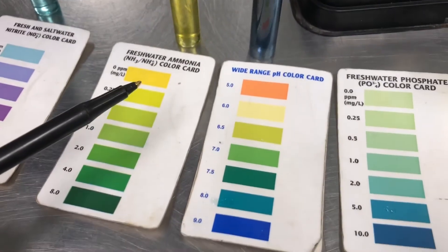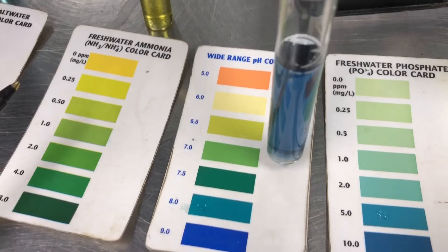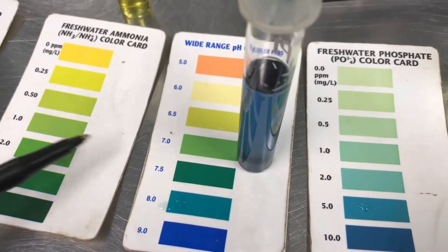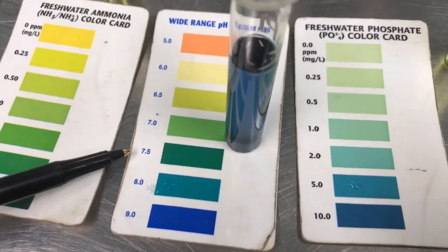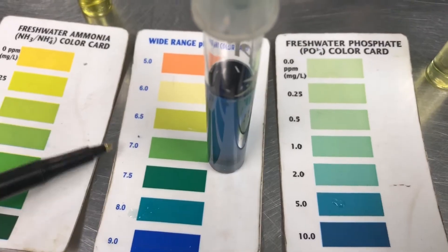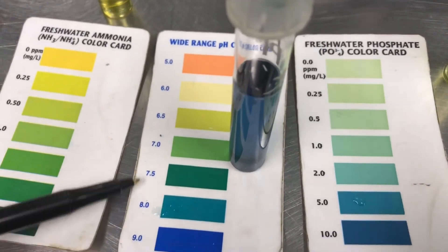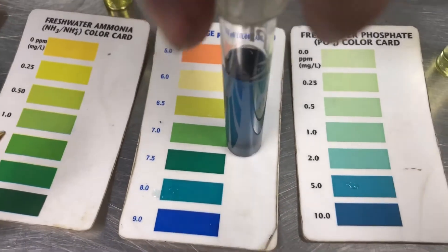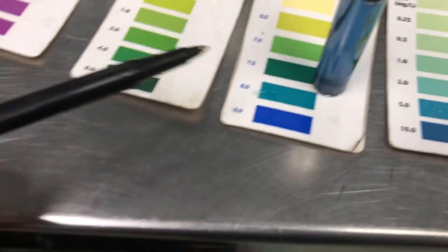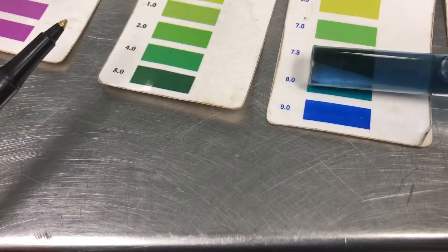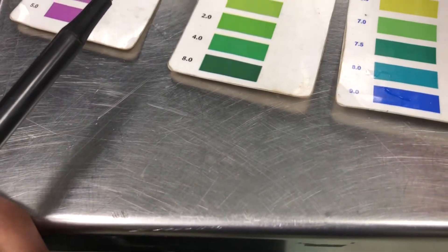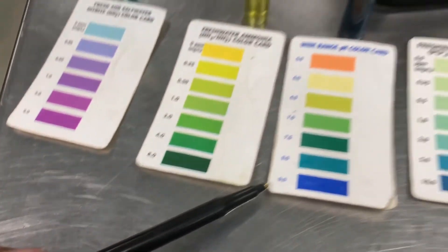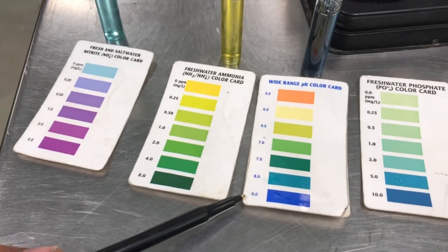pH. Now pH is a little different. You want pH at 7.5 is perfect. You know, I'd say anywhere from seven to eight is going to be okay for most ponds. You can kind of see this one here. It's showing, let's see what it's showing. It's showing almost nine. So this customer's pond has a little bit too high of a pH.